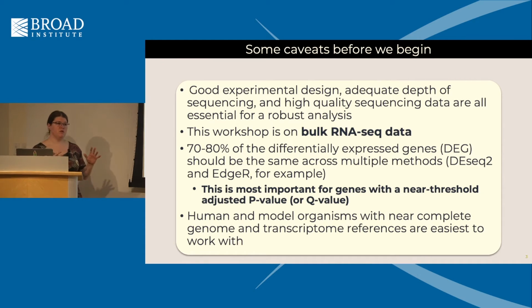But this is very specifically for when you take a tissue and you remove some cells, and you remove the RNA from them, and process it and sequence it in various ways. This does not apply to when you're talking about single-cell analysis, which is substantially more complex.